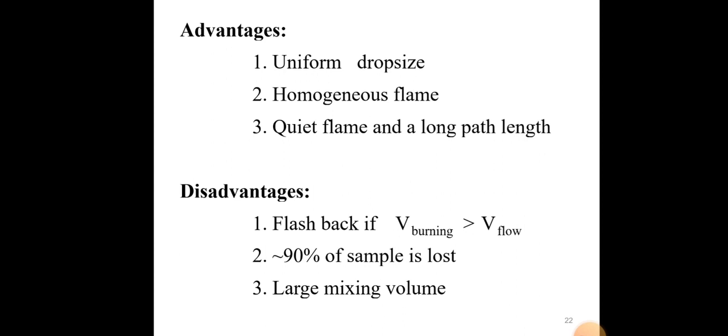But its disadvantage is the possibility of flashback of the flame and explosion if the rate of burning is higher than the rate of gas flow.